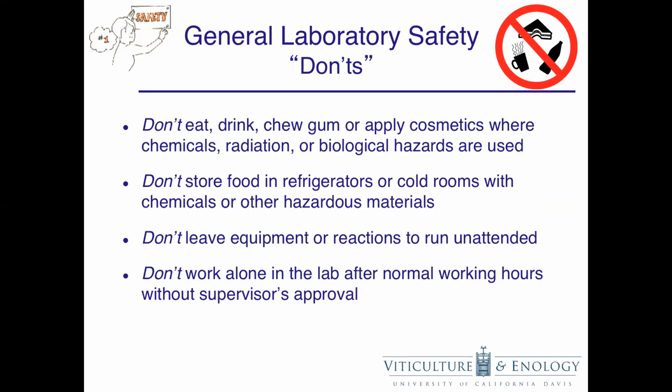There may be some procedures where working alone poses a hazard and is therefore not allowed. If working alone is approved, make sure you are familiar with emergency procedures and emergency contacts. A notification within each lab when a person who is working alone arrives and leaves the building is advised. Each lab is responsible for having a working alone SOP.